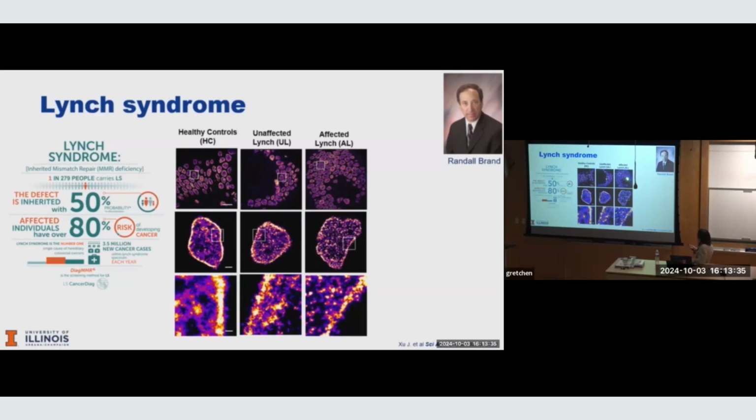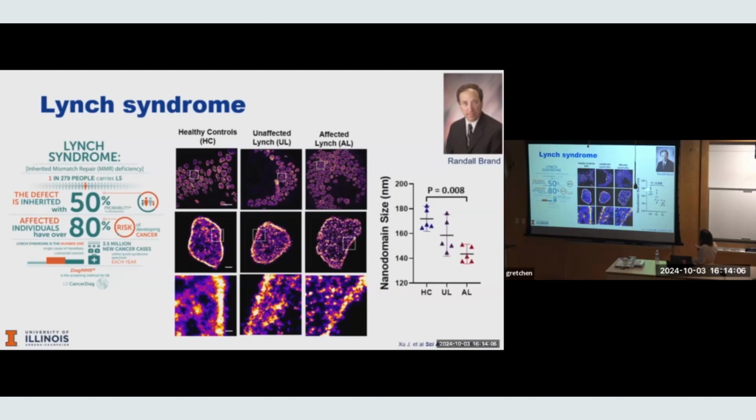But if you compare that normal tissue versus the true healthy controls, you clearly see more fragmented chromatin compaction compared to this densely packed structure from the normal patient. So what this tells you is this concept of field cancerization. The cancer affects surrounding tissues. This is another angle to justify that chromatin compaction could be used as a risk stratification marker. So that's what we looked at.